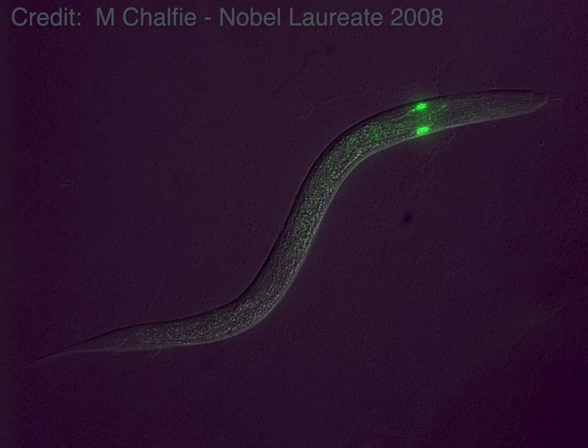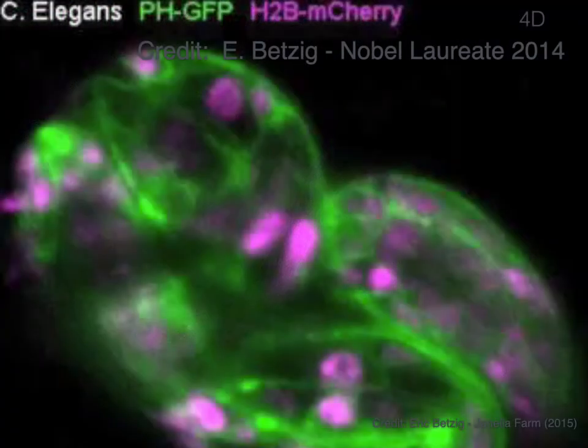And when you move to Martin Chalfie's studies on the worm, what you see is that the expression of a specific protein that is also able to emit light, a green fluorescent protein, offers you the possibility of following the development of the nervous system. This can also be done in living systems, as Betzig, Nobel laureate for super-resolution microscopy, did years ago.